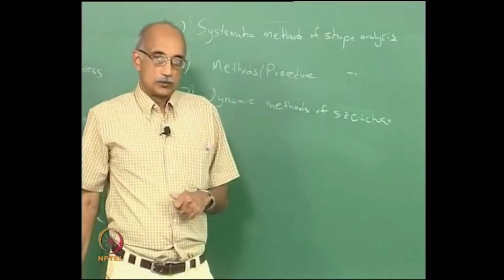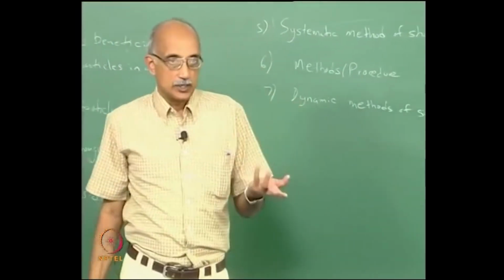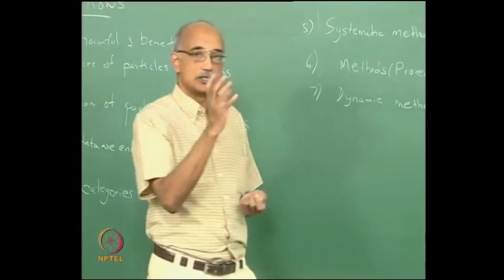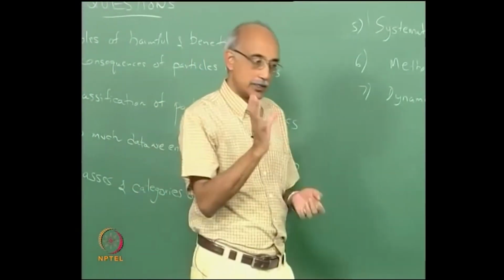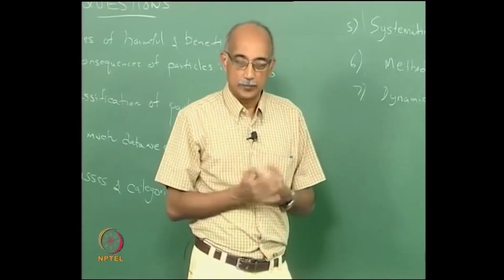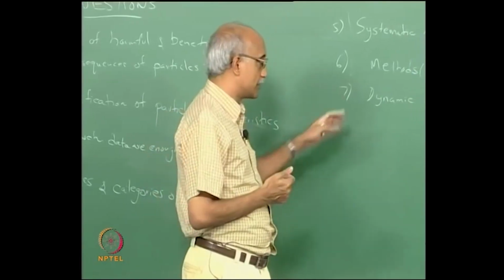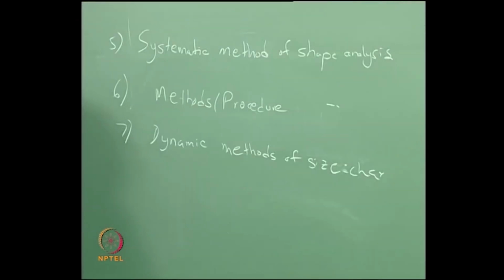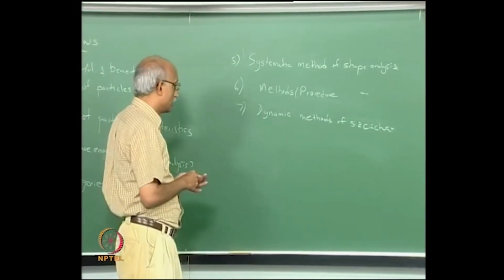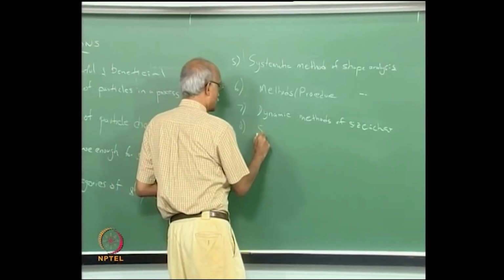So we talked about methods such as sieving, sedimentation, centrifugation as methods that essentially set particles in motion, and by looking at their dynamics, you assess the size. Now these methods are typically used to obtain not single particle sizes, but rather the size characteristics of a population of particles.